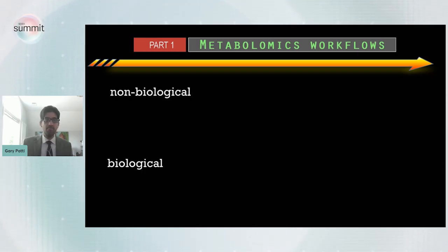Now, to that end, we've spent quite a lot of time over the last decade or so, we and many other groups around the world, to try to understand what these signals could be. And in that vein, what I'd like to do on this slide is develop a picture of what we've come to think of as the roadmap of an untargeted metabolomics LC-MS-based data set.